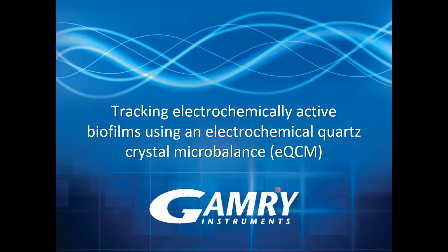The purpose of today is to touch on why we care about electrochemically active biofilms and how you use EQCM to study their growth on electrodes. I don't have biofilm slides to go over. This isn't really focused on biofilm formation, quorum sensing, and things of this nature.